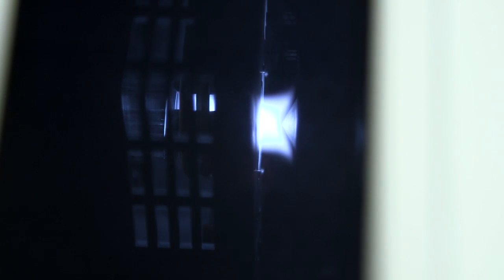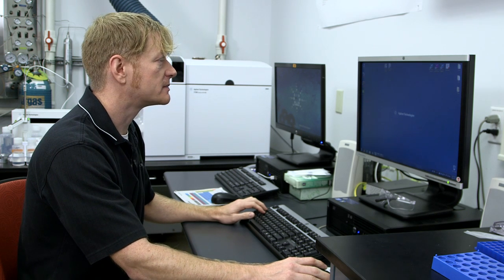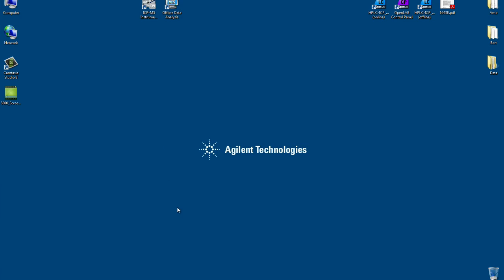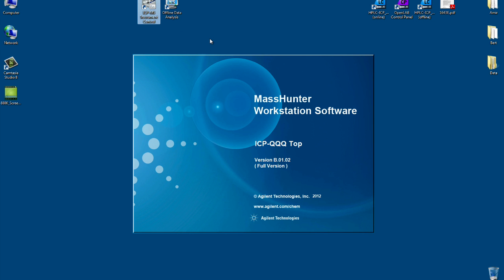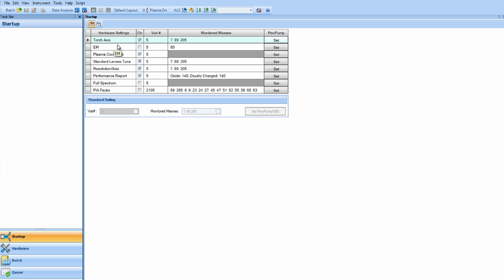So now I'm going to take you through the Agilent 8800 MassHunter software. For this, we will go through the ICP-MS instrument control icon. From here, we can turn the plasma on and go through the startup protocol of the Agilent 8800. The startup protocol has several parameters that the instrument will do for its tuning function.